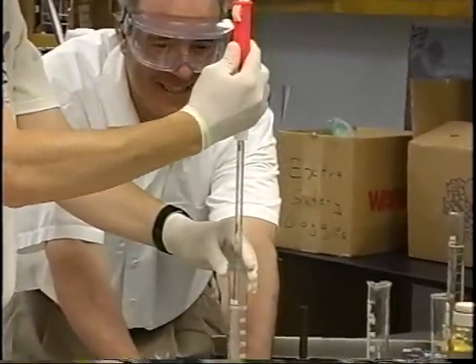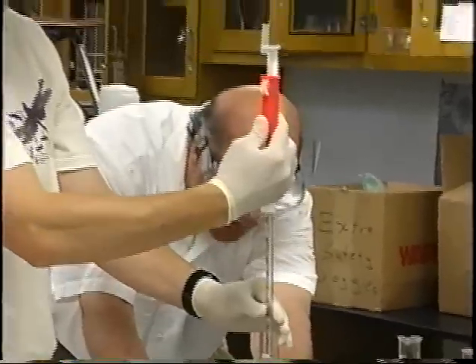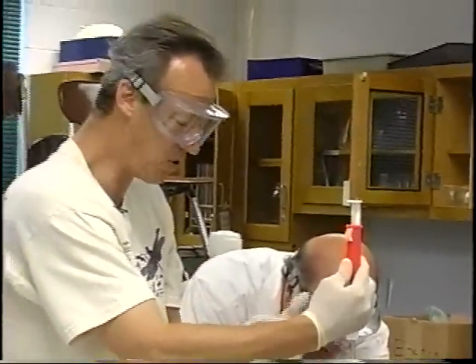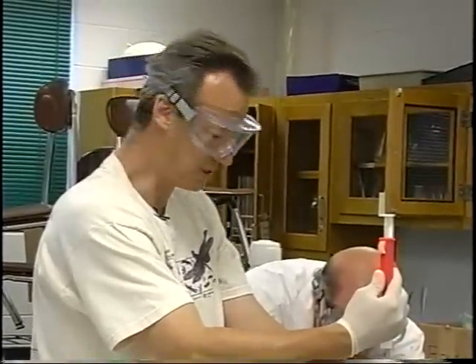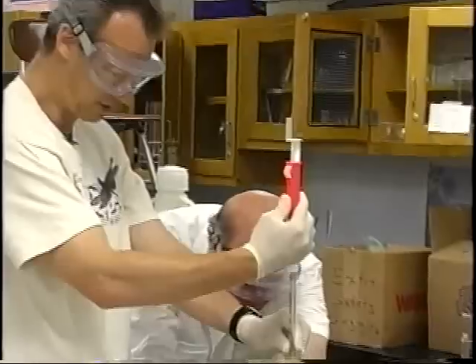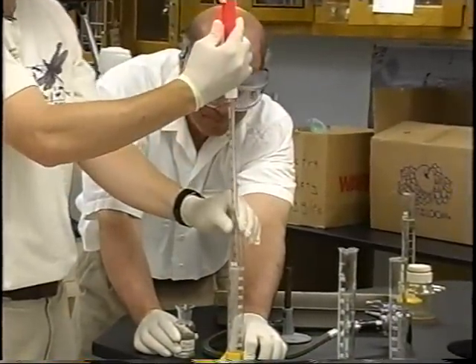If I add the water in here first, the river water, and then follow that with the deionized water coming in, it will do all the mixing for me. So you don't need to stir it up or shake it or turn it upside down or anything like that. So we're slowly. There's 10. Now I need one more.